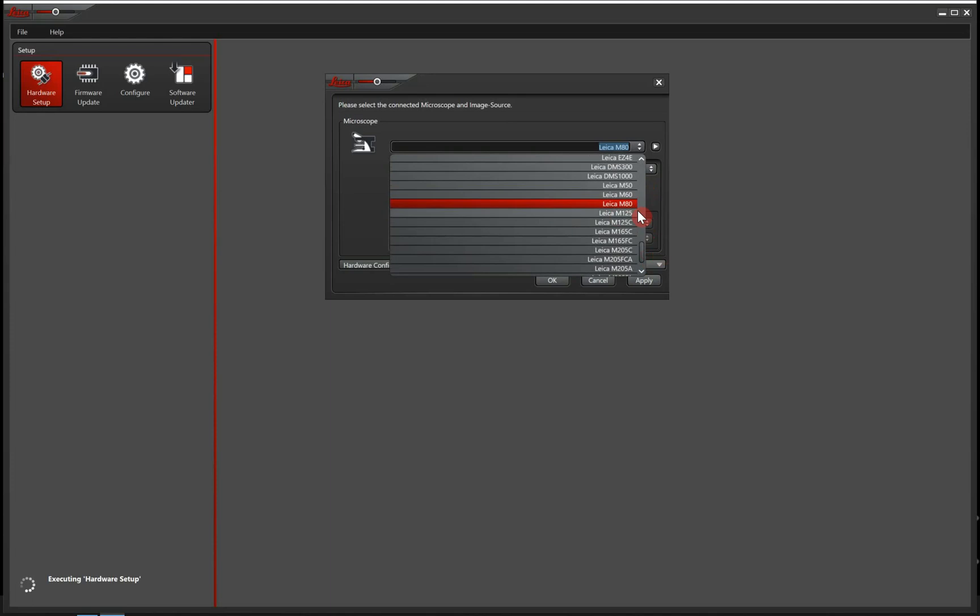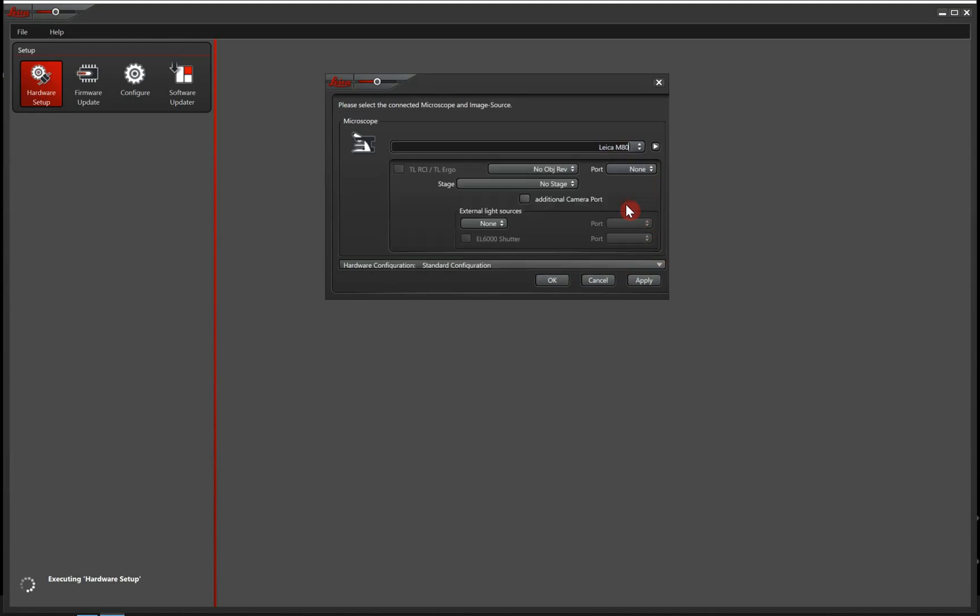So in this video, we say that we have a Leica M80 that we want to configure. We don't have to enter anything else because these are the parts for motorization and coded microscopes. And for this video, we are just talking about manual microscopes. So let's press OK.